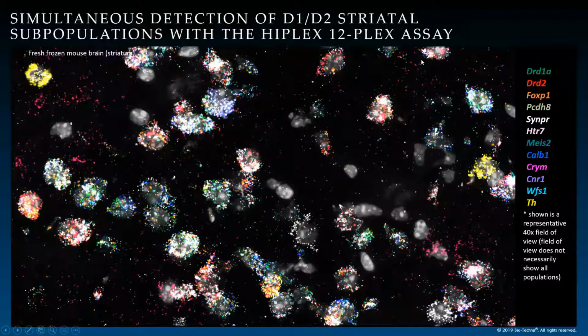And with our registration software, you can actually visualize all of them together and toggle between these genes to only study the specific subtype of your interest and understand how they are spatially oriented within the brain.